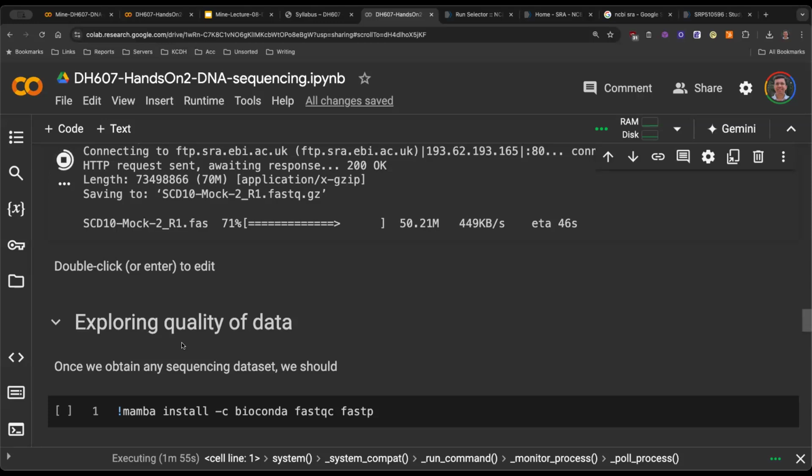So your DNA sequencer will give you the information for A, C, G, T and so on. Now the sequence that you get is 150 nucleotides long in this case. You will see in just a bit. But the fragment that you sheared would have been much longer. You're limited by the technology, so the technology only sequences 150 base pairs, right? So your fragments would be this fragment 1, this fragment 2, and so on.